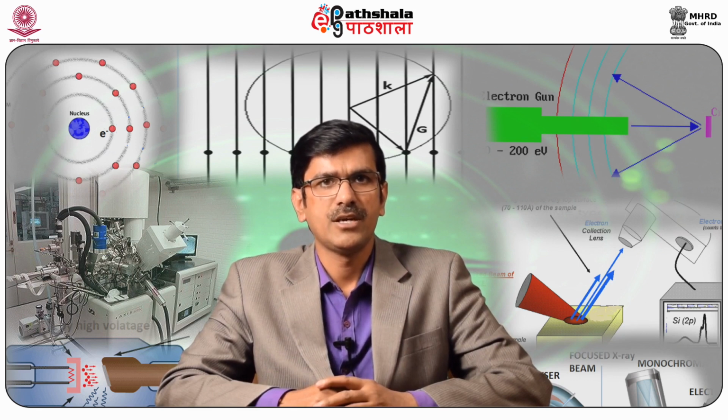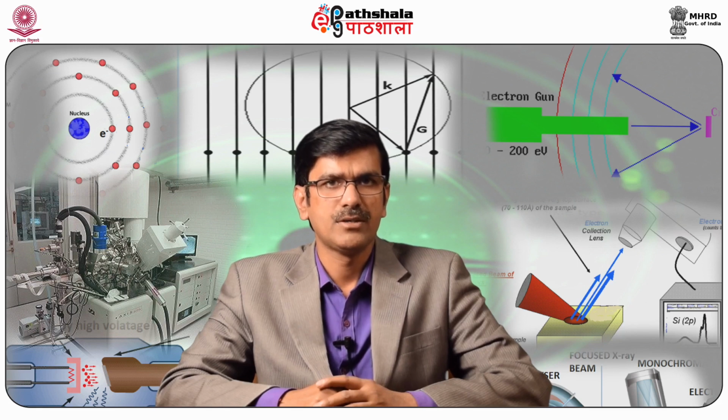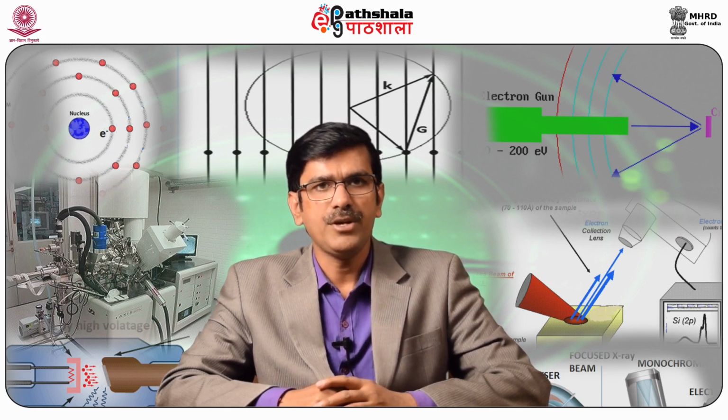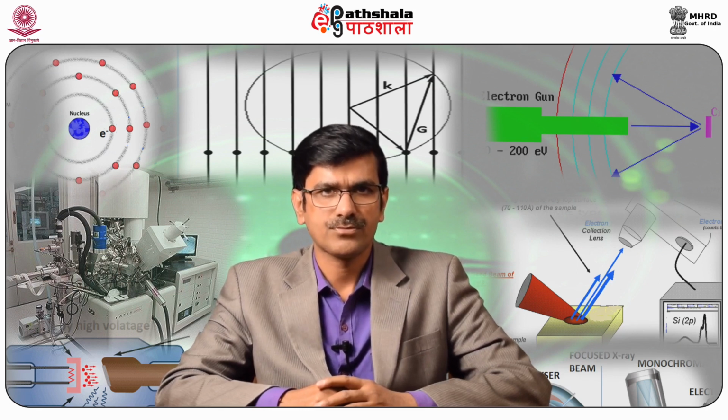There exist a number of reasons for choosing to use an X-ray monochromator on an XPS spectrometer. The primary reason for using monochromated radiation is the reduction in X-ray line width. Narrower X-ray line width results in narrower XPS peaks and consequently better chemical state information.